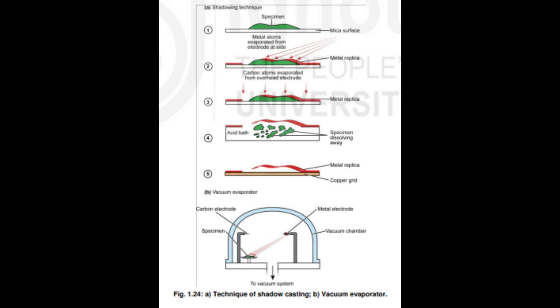Various other versions such as phase contrast, confocal and fluorescence microscopes, developed over time, provided a medium of studying structural details of the cell sample specimen present in any medium or form. The change of source of illumination from light to electrons significantly improved the resolving power of the microscope.